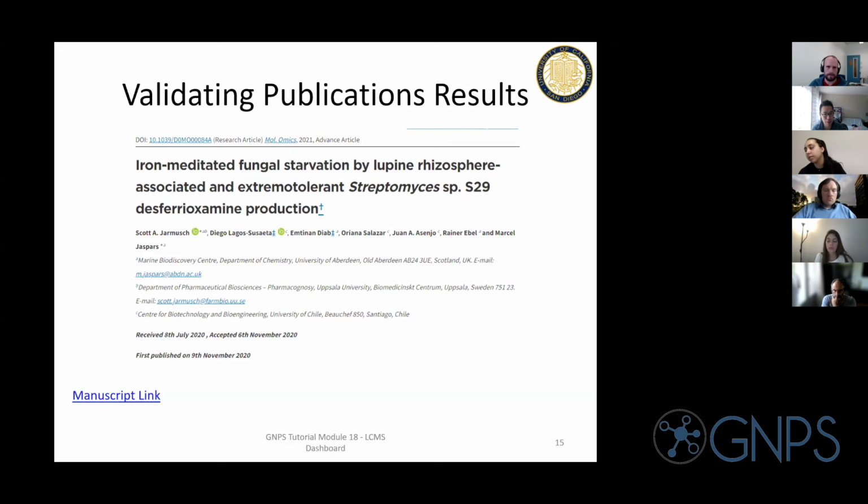We figured the visualization is a reasonable starting point. But we do export nearly all the graphics in either PNG, if you wanted to paste it into a PowerPoint, or SVG for Illustrator purposes. So those are all exportable right now. Anyway, great questions, and thank you for bringing that up. It's a little hidden when you're sharing your screen. Any other questions? You can chime in on the chat.